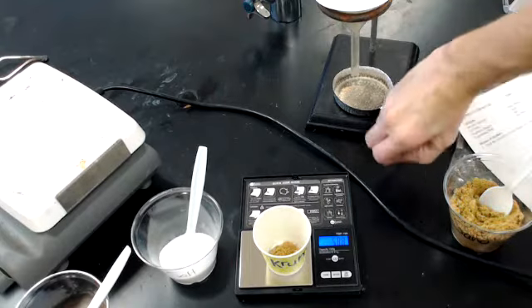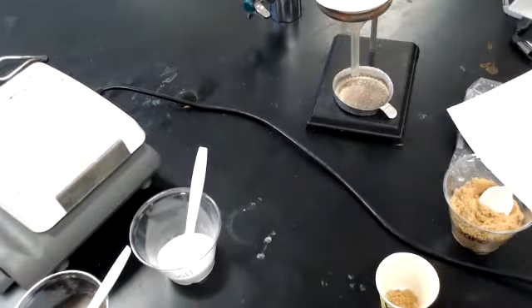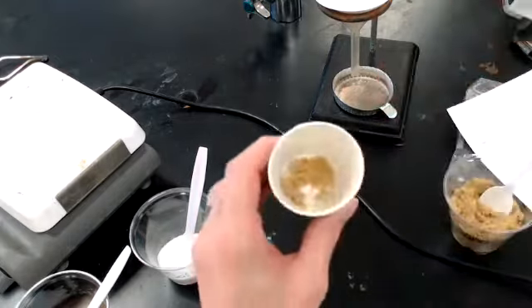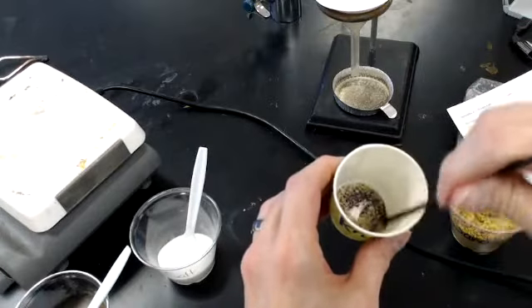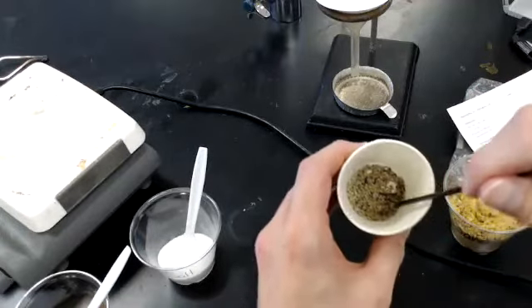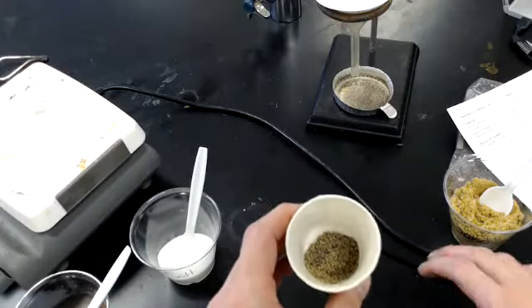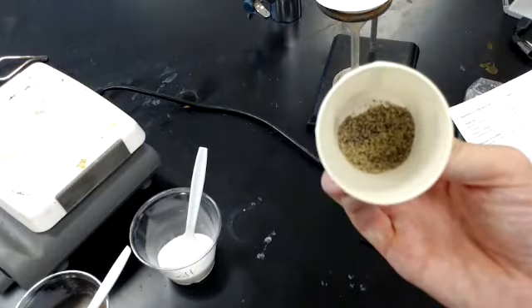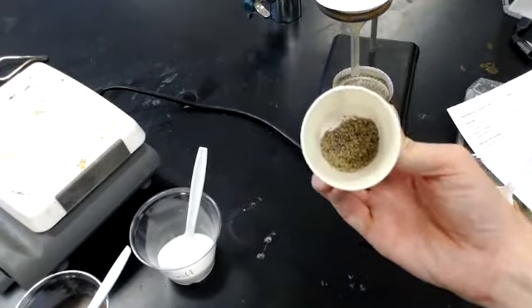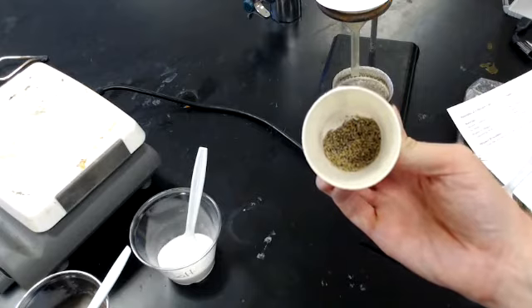So what I'm going to do now is, I'm actually done with mass for a while, so I'm going to remove my balance, turn it off for a moment, and get it out of our way. And I'm going to stir this up. I'm just going to take my little stir stick here and do some stirring. Stir, stir, stir. Doesn't that look delicious? I hope not, because you're not supposed to eat it. There we go. Okay, so I've stirred it up, and now you're going to make observations about this mixture. Pause and make 3 observations about this mixture.